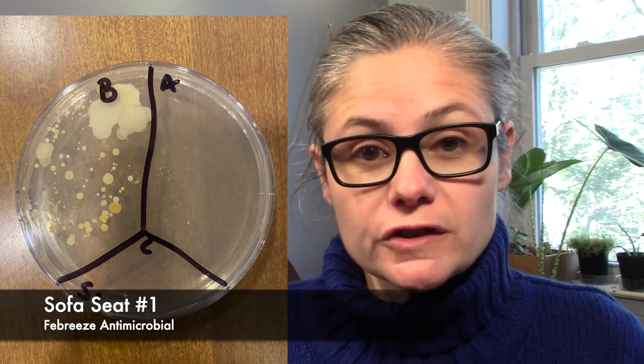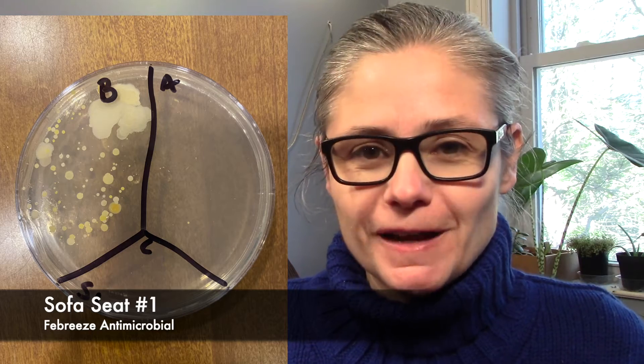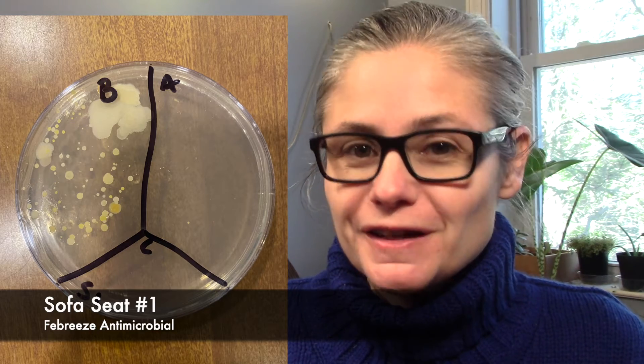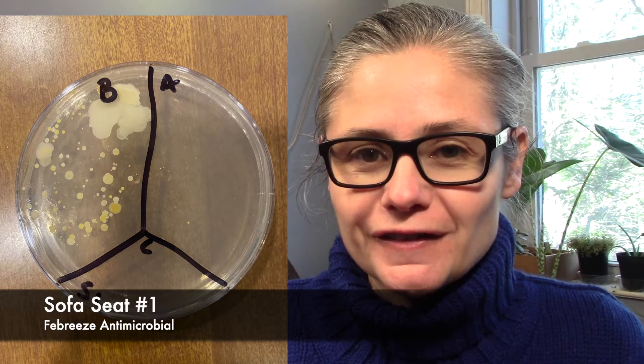On to the seat of my couch. So the first sample — same sort of result: lots of bacteria, a beautiful sampling of bacteria in before, and in after we have one bacterial colony. That is absolutely tremendous.